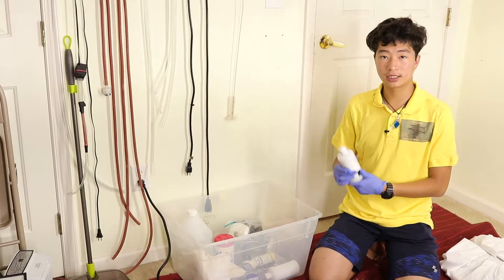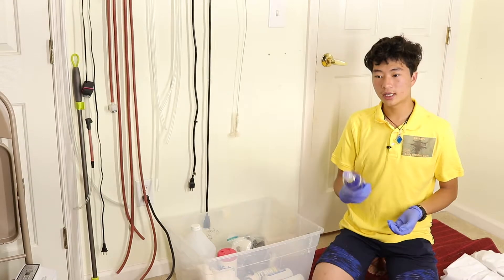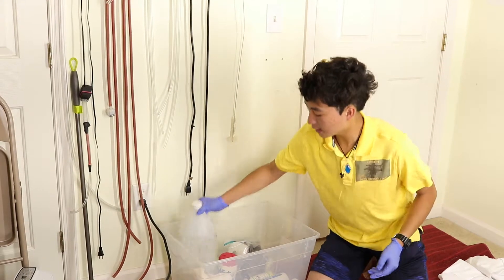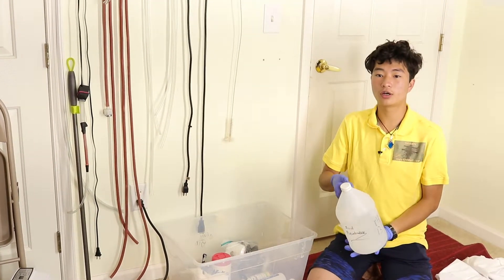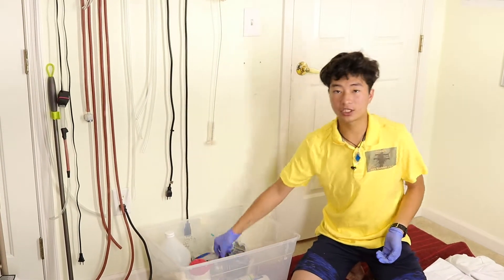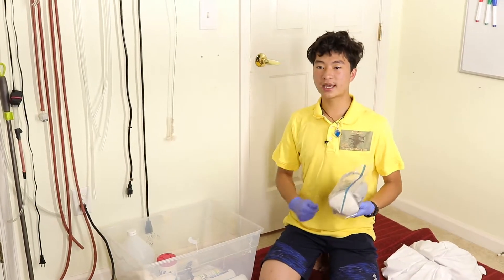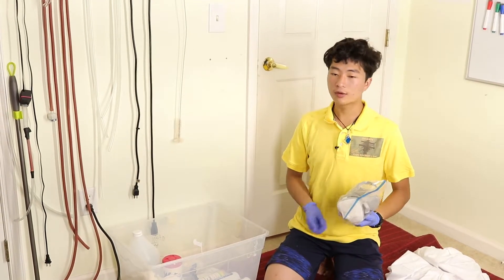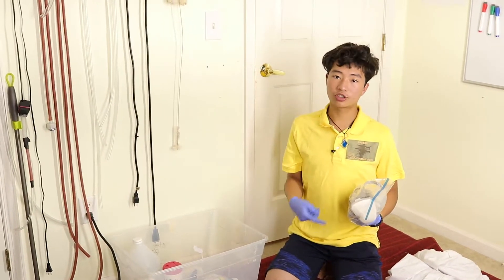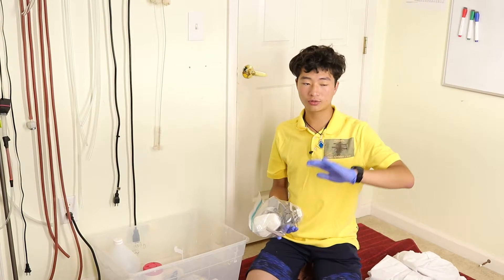Here is my safety box. Inside I have eyewash — just saline solution — burn relief, and bottled water, which is also useful for diluting spills. I have an alkaline wash for acid spills — just dump it right on top. There are additional pairs of safety goggles just in case, and a gas mask. That gas mask has saved me multiple times. One incident was when the bathroom fan failed while I was pumping too much hydrogen chloride vapor through it, leaving corrosive vapor throughout the room. I grabbed the gas mask and was completely fine.